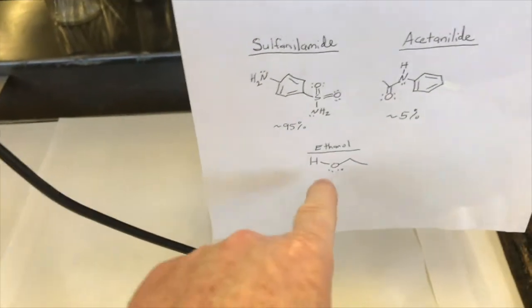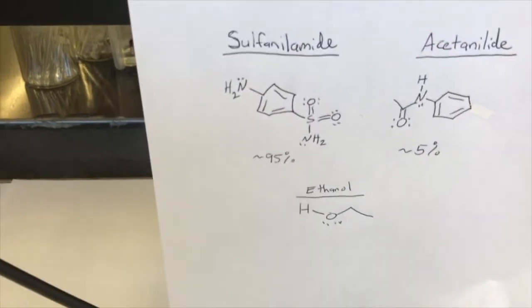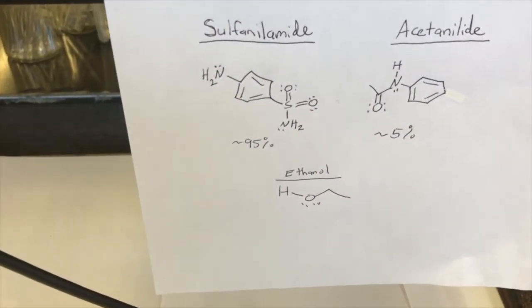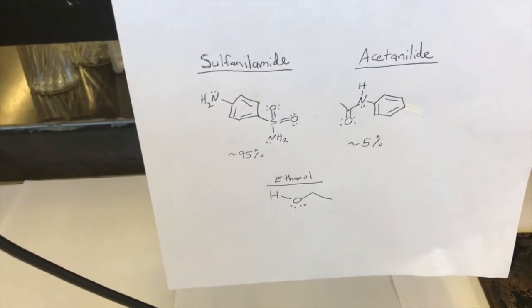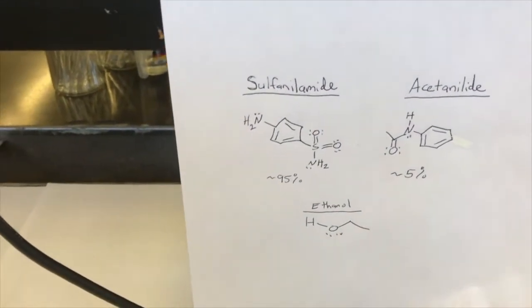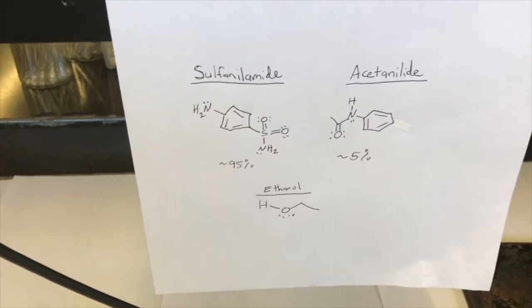We're going to do that using the most common organic solvent for crystallizations, the ethanol. And ethanol is, of course, the alcohol in spirits and liquor, beer, wine, other things. And so we're going to be doing our crystallization in ethanol, the main active component of liquor. So we'll be using it as our mother liquor, as we learned.